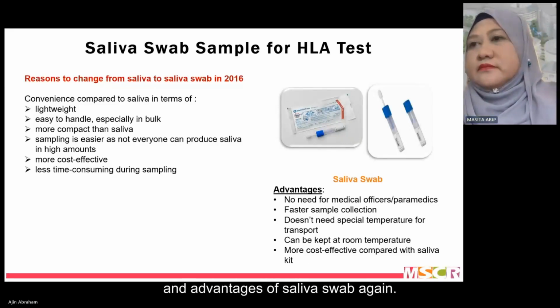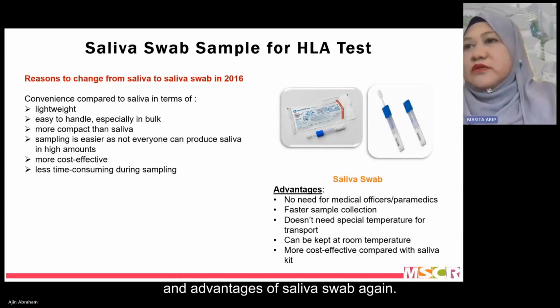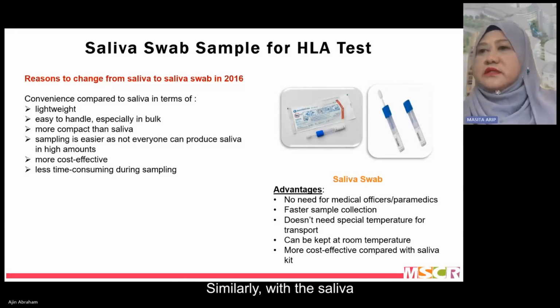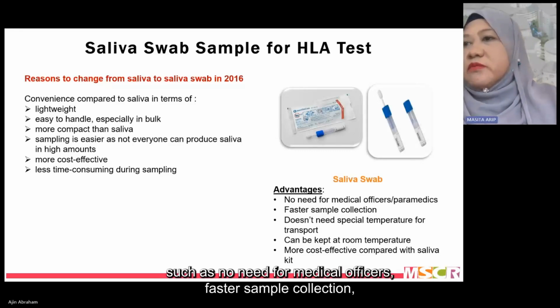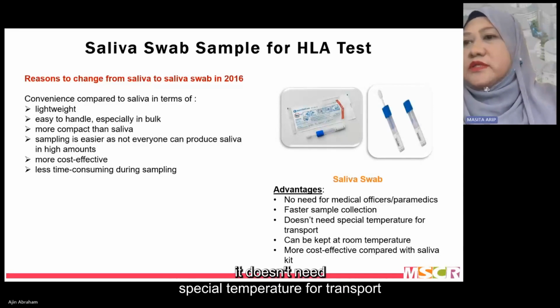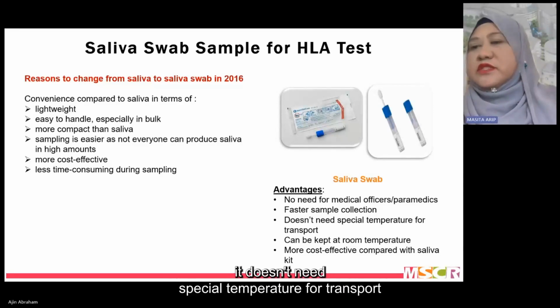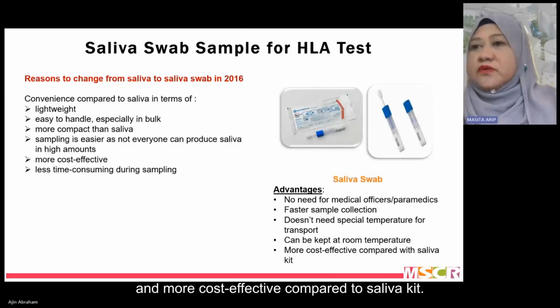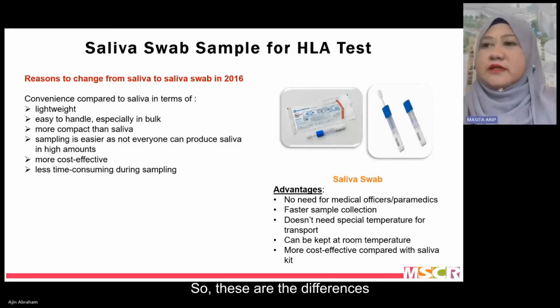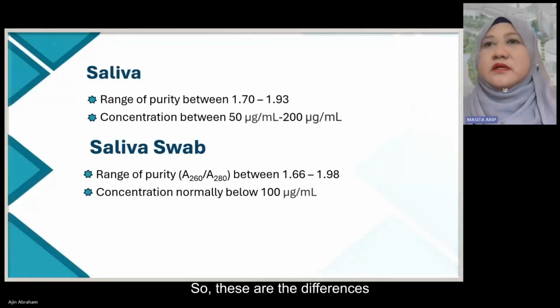sampling. And the advantages of saliva swab are again similar to saliva, such as no need for medical officers, faster sample collection, doesn't need special temperature for transport, can be kept at room temperature, and more cost effective compared with saliva kit.